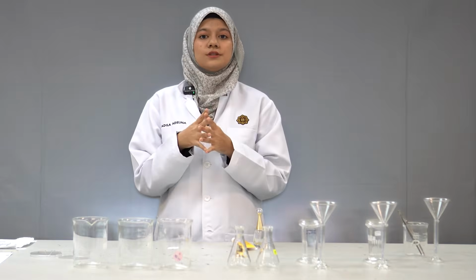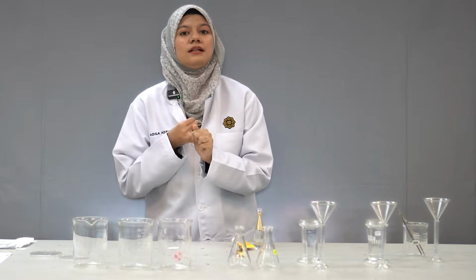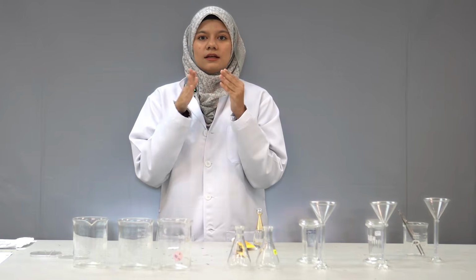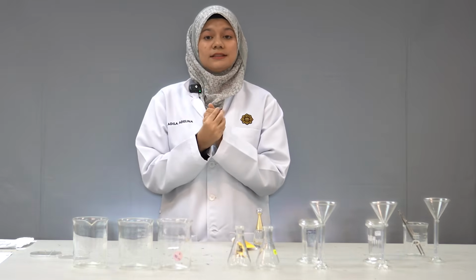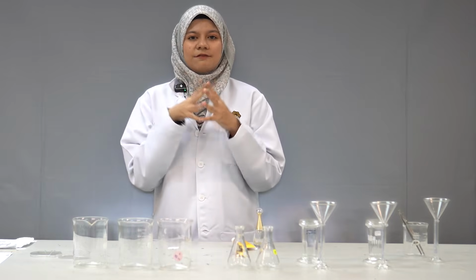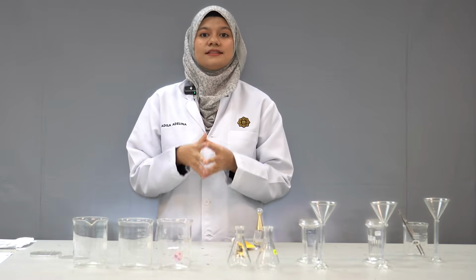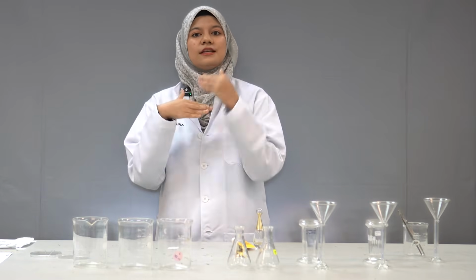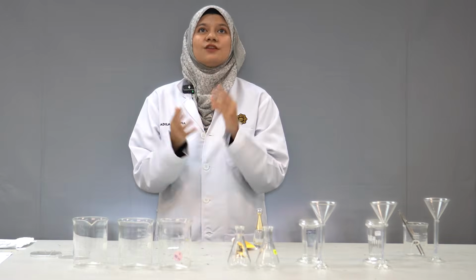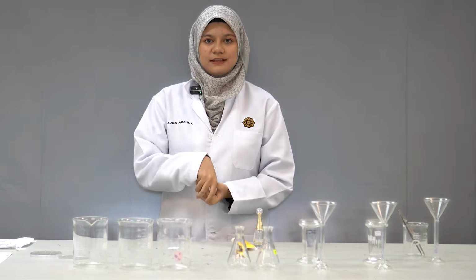It is widely used to identify pollutants and chemical contaminants in environmental samples, such as water, air, and soil. Environmental scientists usually use the TLC method as a screening step before they proceed to more advanced analysis, because it is fast and inexpensive.